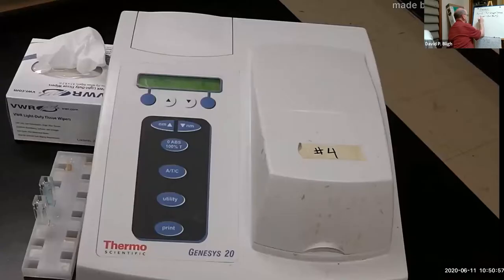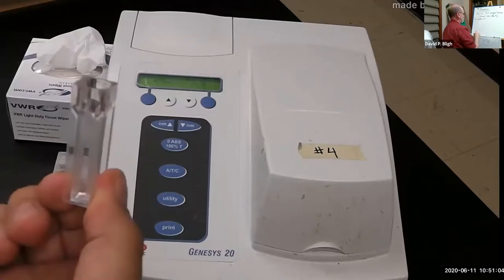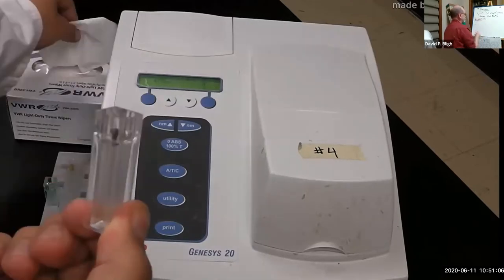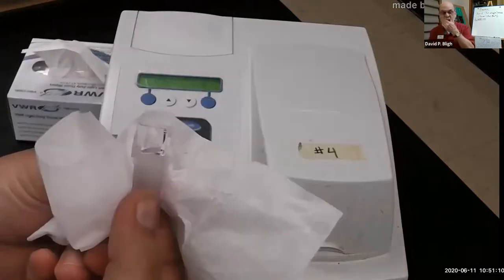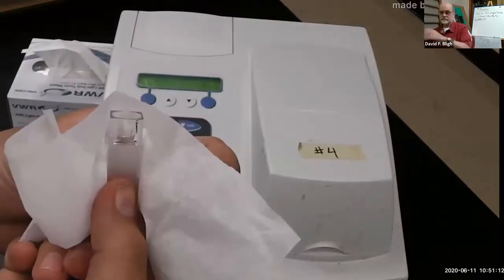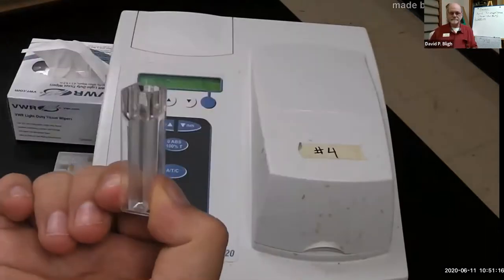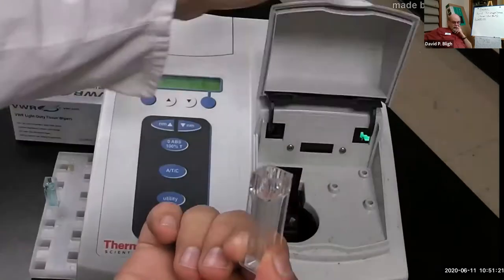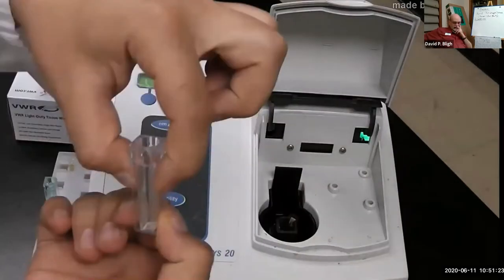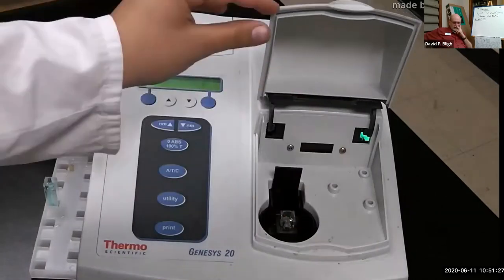Whenever you begin using the machine, or after you've adjusted the wavelength, you must blank it. Simply take a cuvette with deionized water, or whichever your blank must be, take a Kim wipe, and gently wipe the transparent sides of the cuvette. Be careful not to scratch the sides of the cuvette, as that will produce inaccurate readings. Next, open the hood and firmly and carefully insert the cuvette, making sure not to spill any drops into the machine, and close the door.